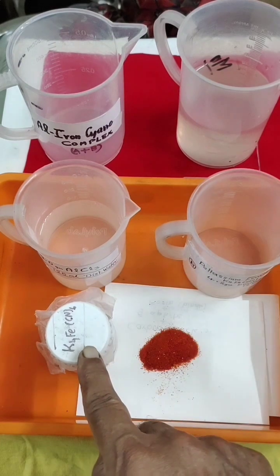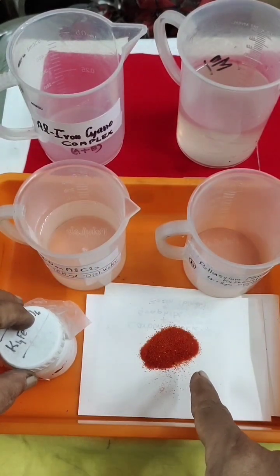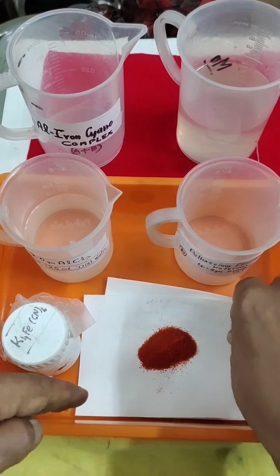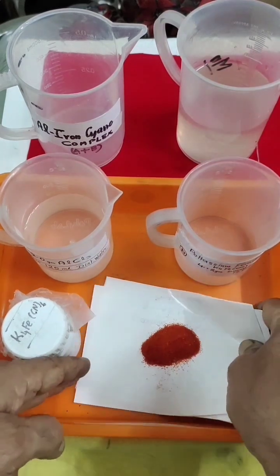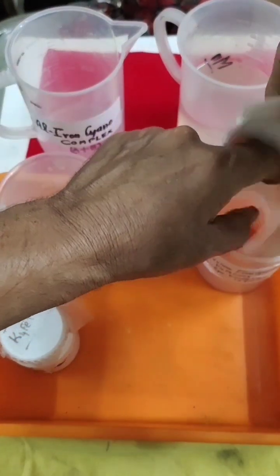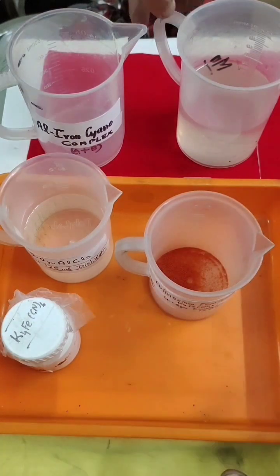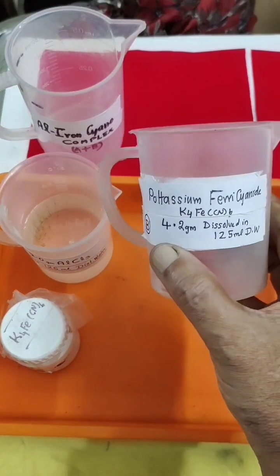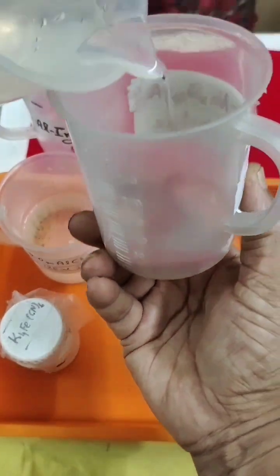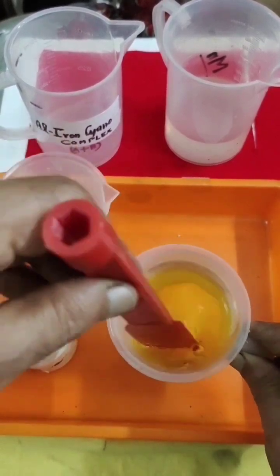Next we need potassium ferricyanide. This is potassium ferricyanide — this is the color of it. We take 4.2 grams; the details I'll put in my diagram. This is 4.2 grams of potassium ferricyanide. We'll transfer it into here and add 125 ml of distilled water, also called deionized water.